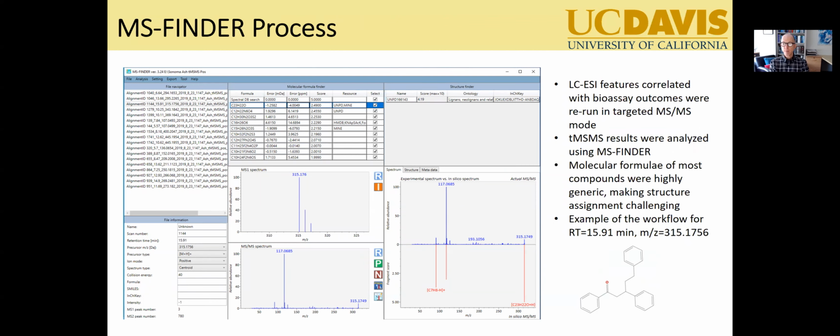So that's been focused on the GC results, and frankly, we have the best and most comprehensive results for the GC-EI data. It's also probably a function of the aryl hydrocarbon receptor test being the place where we have the best database, and the compounds that are active in the aryl hydrocarbon receptor tend to be GC-able in a way that the LC compounds aren't.